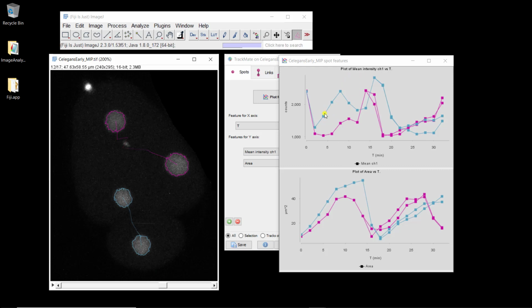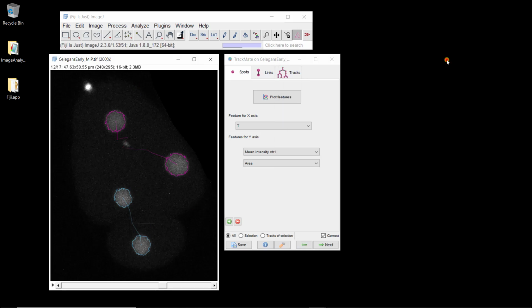So you see that the intensity increases in sequence with this. So you have first the size and then the intensity. So that looks like what we see in the sequence. Obviously, we could do other things.